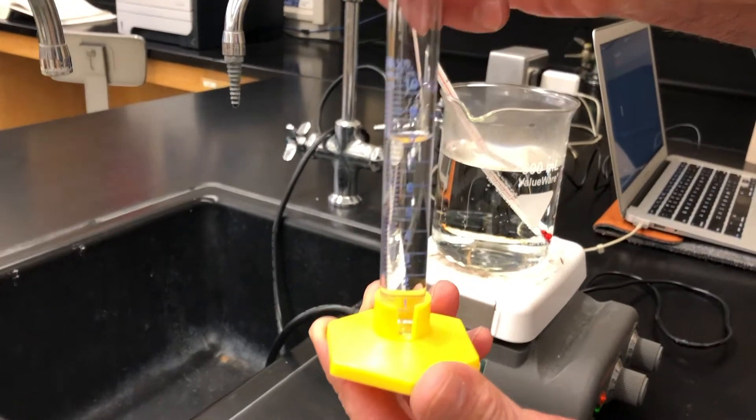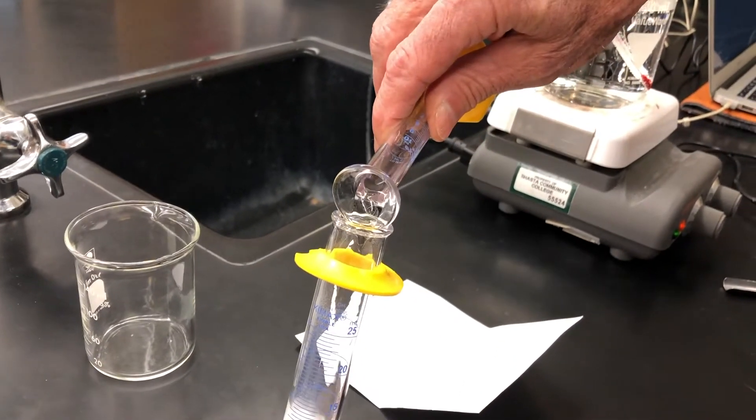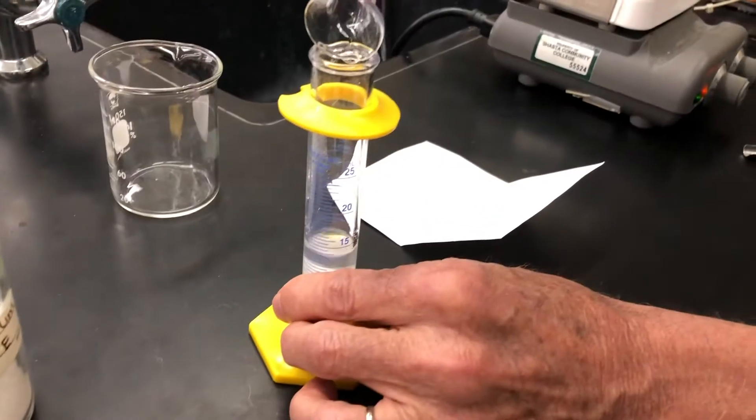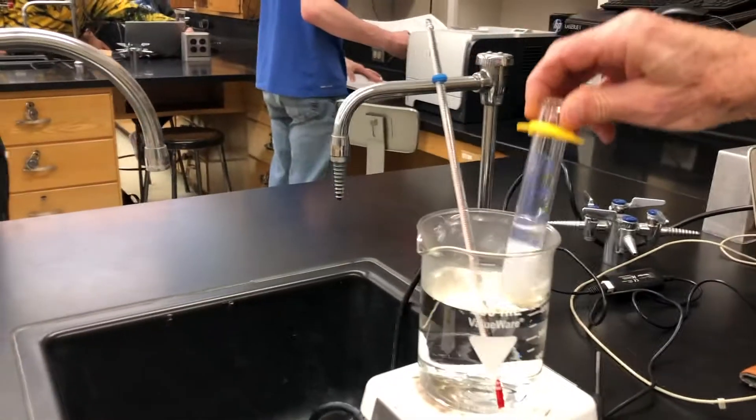We're going to add about eight milliliters or so of distilled water and make a solution. Once it's all dissolved, you're going to need to determine the volume of solution.